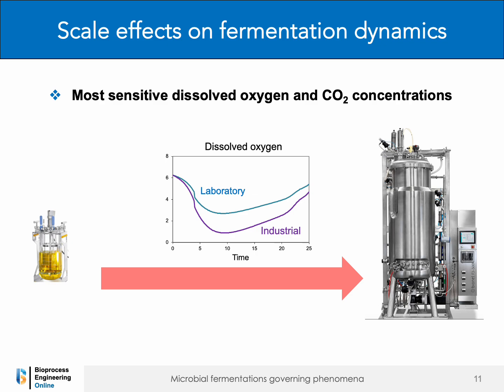Differences in fermentation dynamics often emerge during scale-up from laboratory to industrial-scale fermentations. One of the most notable changes involves the time profiles of dissolved oxygen and carbon dioxide, which can vary significantly with scale. These shifts can influence microbial growth rates and alter metabolite production patterns.